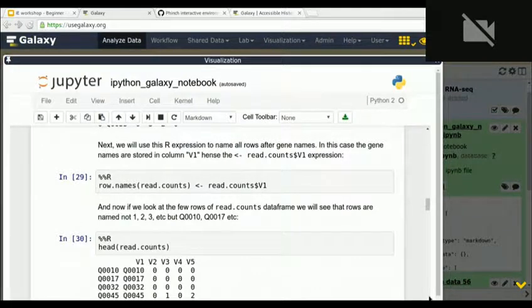These notebooks, you will always have them embedded in a workflow. But what if, like in R, when you do an R Markdown mode, you can run it and then it'll output another format? Is there any way to do that in your work? You send out just a format that has everything run already and all the plots in it? If you use RStudio, then yes.